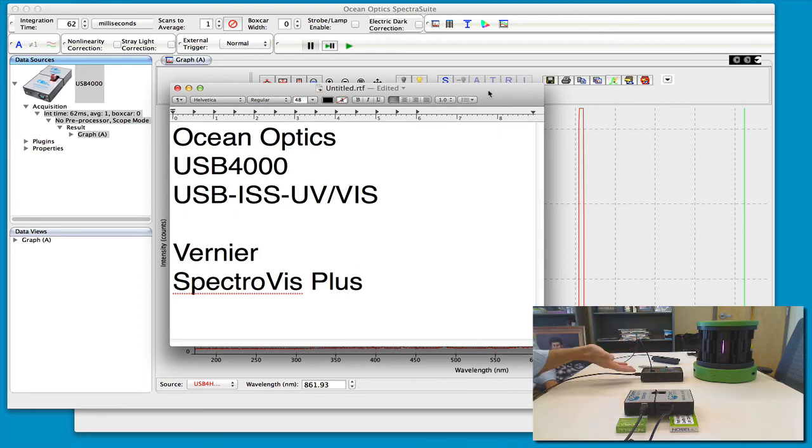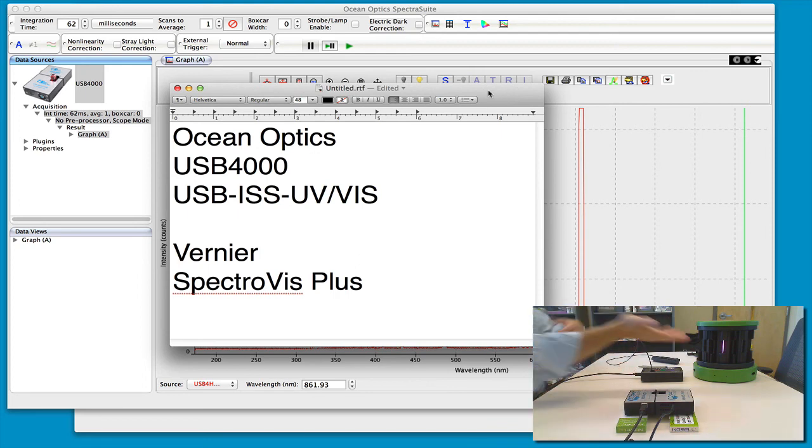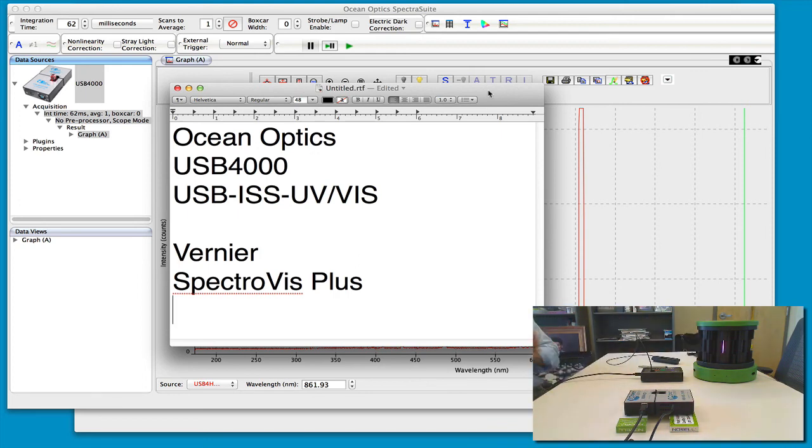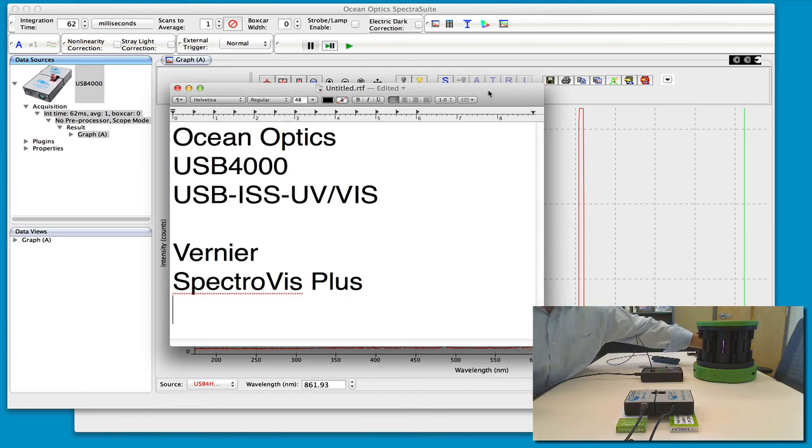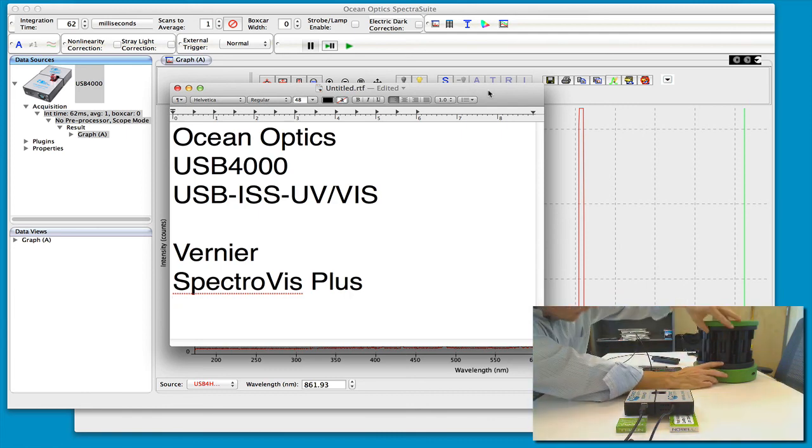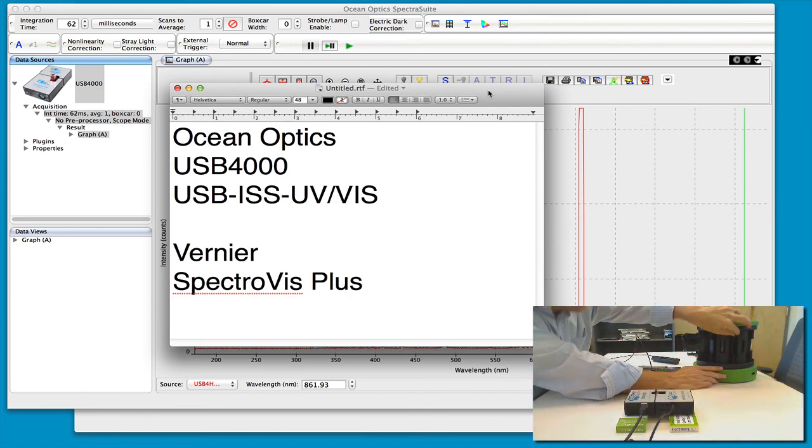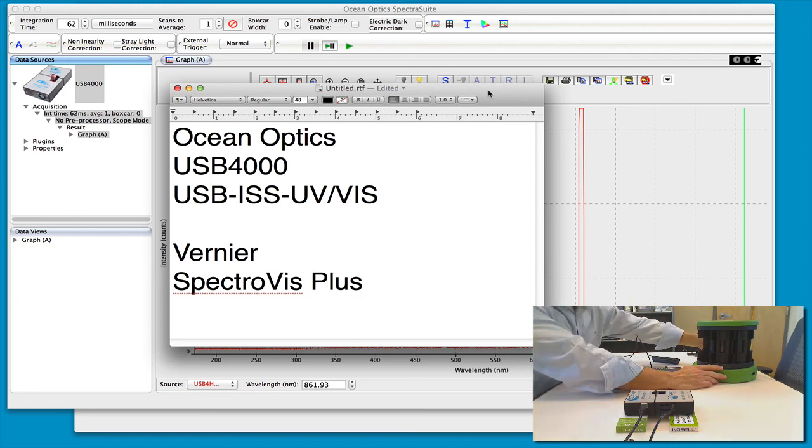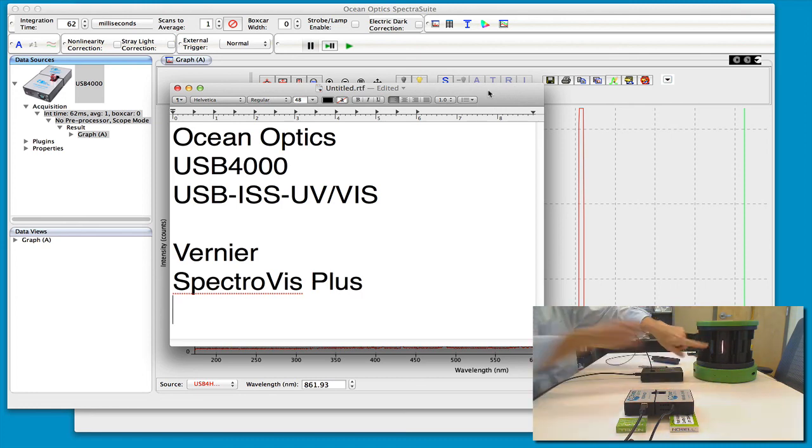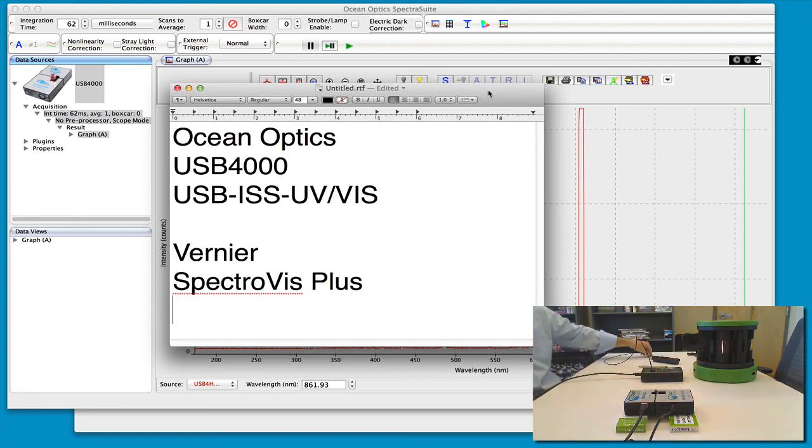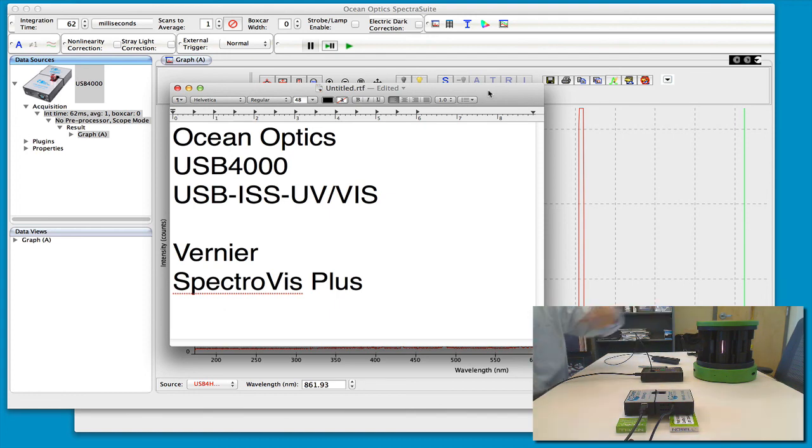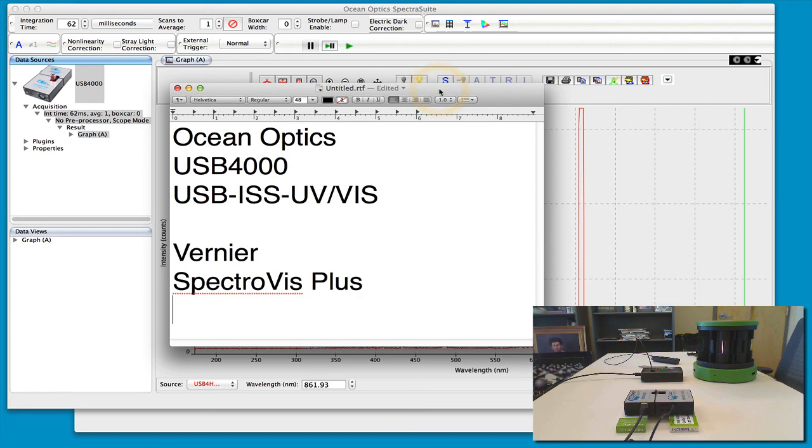And as you can easily see the emission here, we can easily turn this off, move it over to a different gas like helium for example, turn it back on, and we can now hold this up and measure the spectrum of helium emission. So I hope this helps you get started on a simple setup to collect gas spectra or gas emissions.